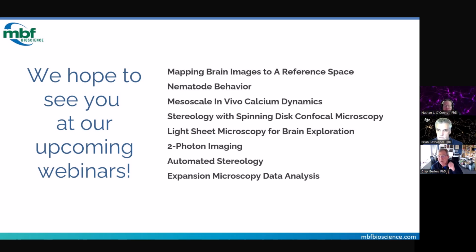And then the real slow part is the imaging of the sections themselves. We image with a 10x objective.